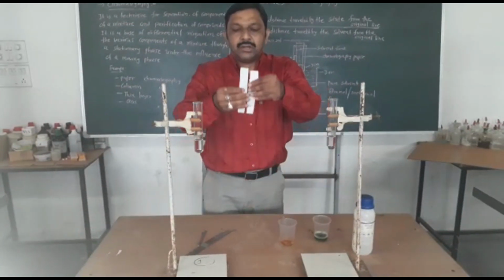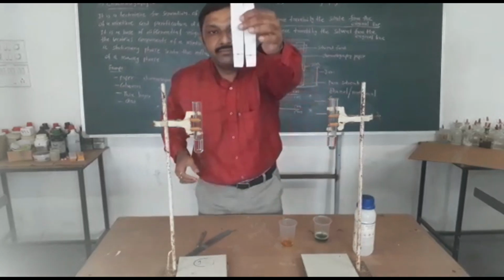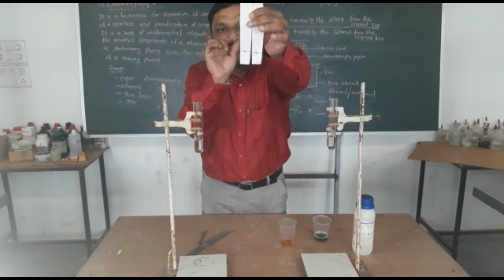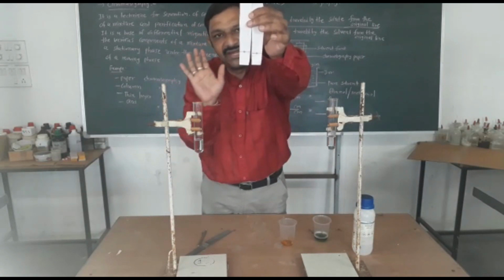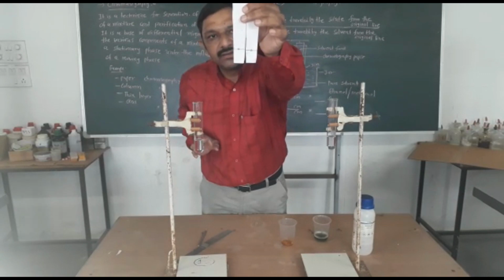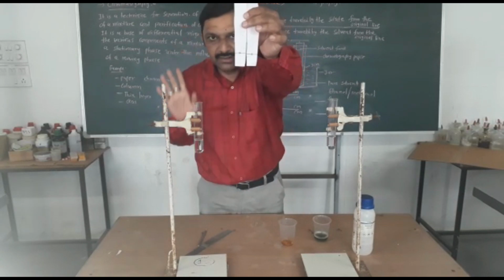So look, I am making a dot in between, on the line. So here is your dot or spot in the middle.